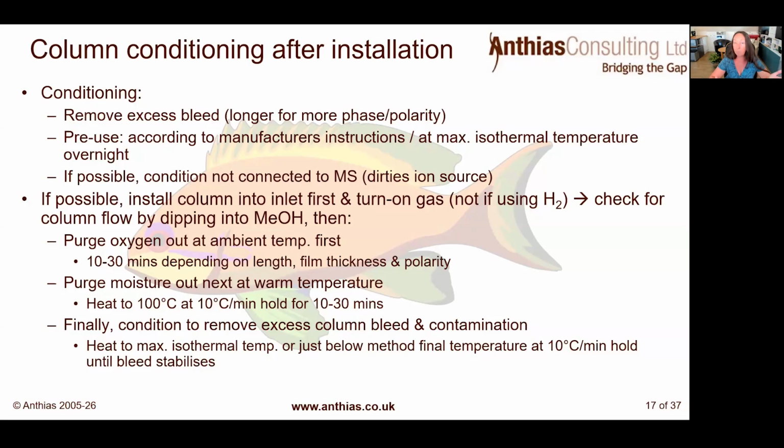The longer the column, the longer you will need. The thicker the stationary phase, the longer you'll need. And the more polar the stationary phase, the longer you'll also need. So again, around 10 to 30 minutes. Purge the moisture out next.